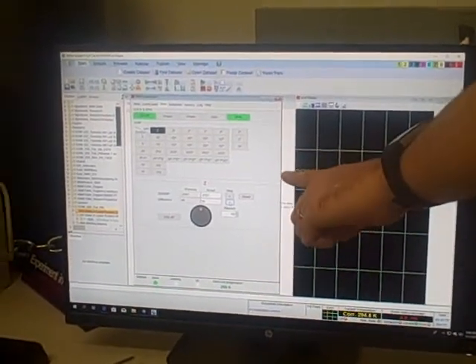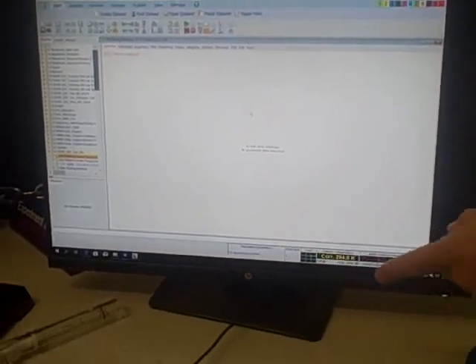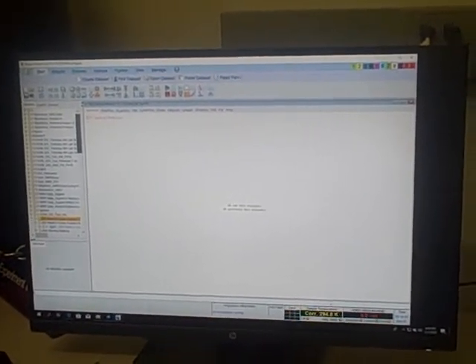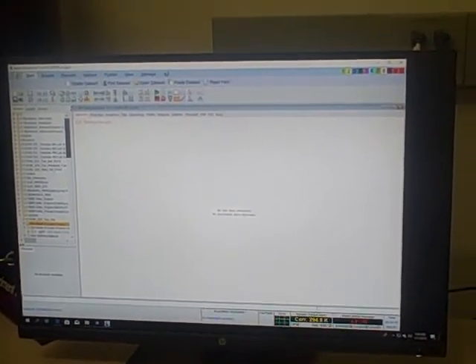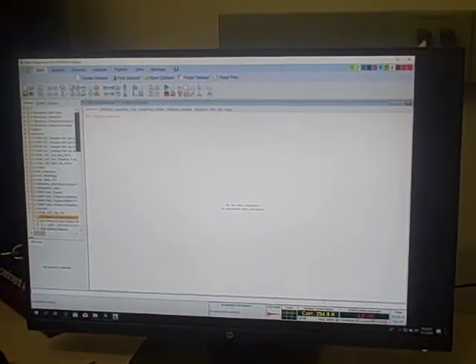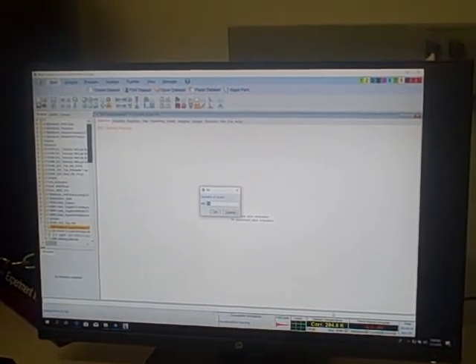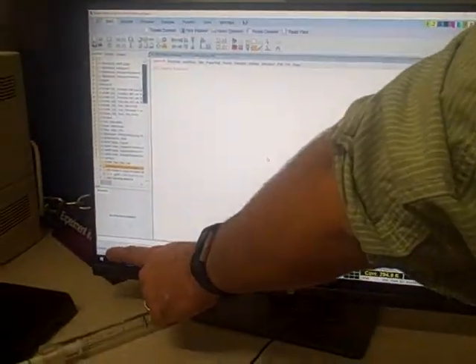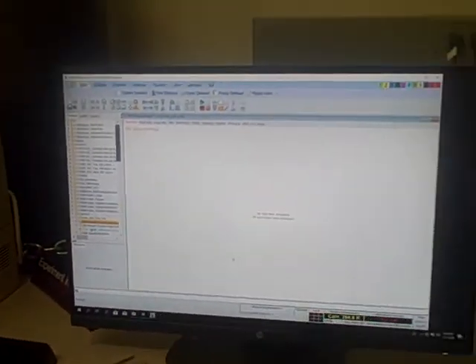So what we'll do is now click on our experimental window, which is behind that, to bring that back up to the forefront. And then we're going to tell the computer to set the receiver gain. So type RGA and hit enter. While that's working, we can tell the computer how many scans we'd like to take. So type NS, hit enter, and we'll type 8 and hit OK. When the bottom left-hand corner, right here, which is our dialog box, says finished, we can go ahead and start the experiment by typing ZG in our command line.